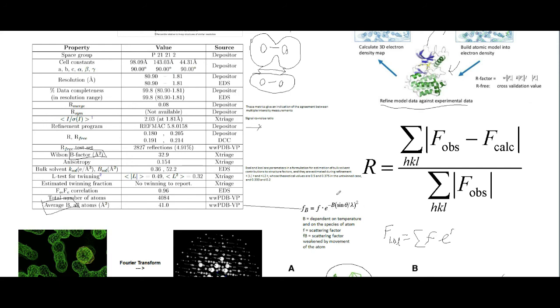But we have to use our B factor to give a correction to our atomic structure factors because the atoms, like I said, are flopping around, and so we can't just say that our atomic structure factor is based off of this sort of nice rigid sphere because the sphere is sort of moving in all different directions, and so we correct that with this B up here being our B factor, and so we actually will use this here, which is our atomic structure factor, corrected with the B factor, and that's sort of the importance of the B factor.